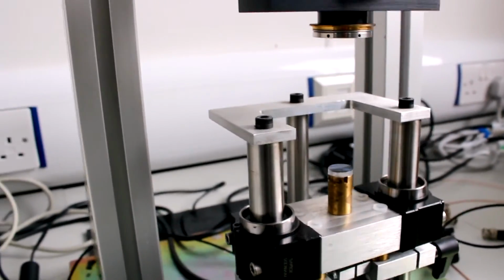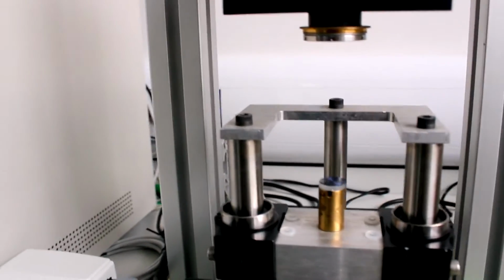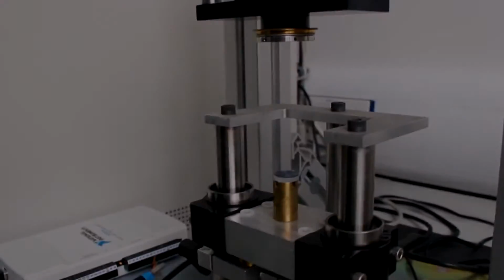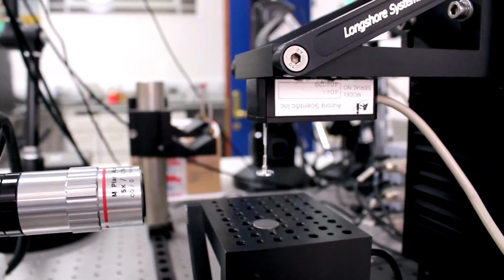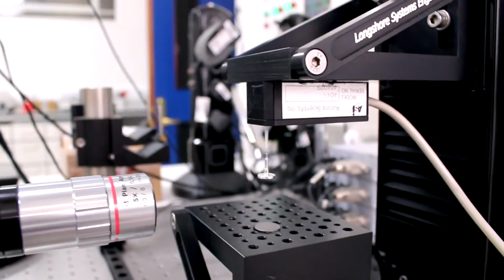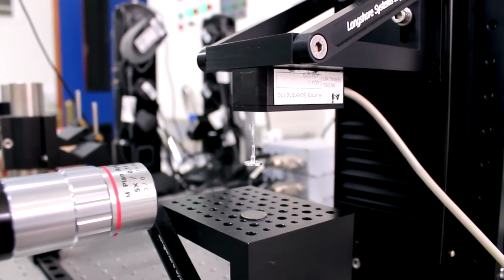So we have a rheometer, and we can use that for measuring properties such as viscosity of Newtonian materials, but beyond that we can also measure shear rate dependent behaviour of non-Newtonian materials, perhaps viscoelastic polymers or particle suspensions in which they exhibit shear thickening behaviour. We can make a relevance of this information to topics such as mixing, where fluids are put into combination and the shear stresses they're exposed to determine their final formulation property.